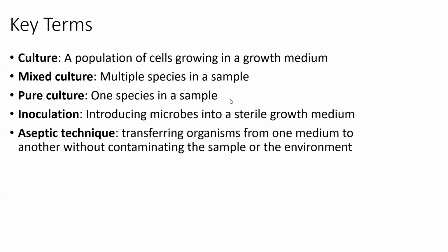Hi everyone, this lab video is reviewing aseptic technique, also called aseptic transfer. But before we dive into the details of this lab, I want to review a few key terms with you that I have used in previous videos, but I want to make sure we're all crystal clear on some of the lab terminology that you are going to hear this semester.